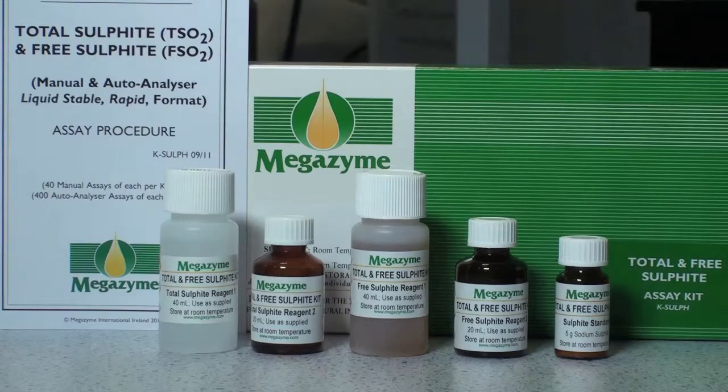The Total Sulphite Reagent 1 and 2 and the Free Sulphite Reagent 1 and 2 should be used as supplied. The Sulphite Standard is supplied as a powder and is used for the preparation of the Total Sulphite and Free Sulphite Standards and Calibration Curves.